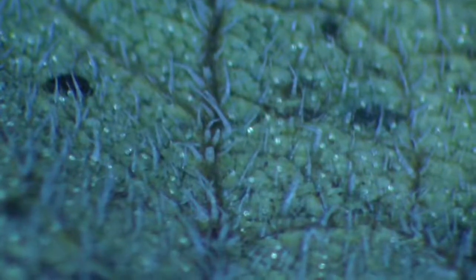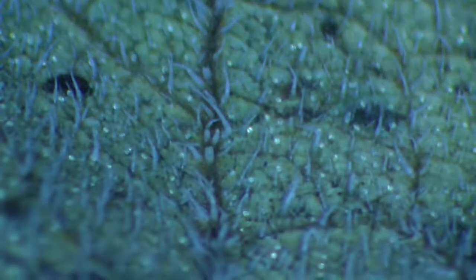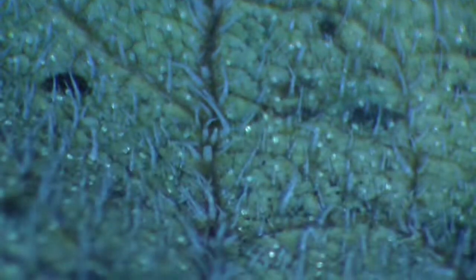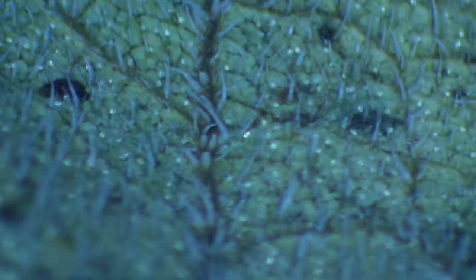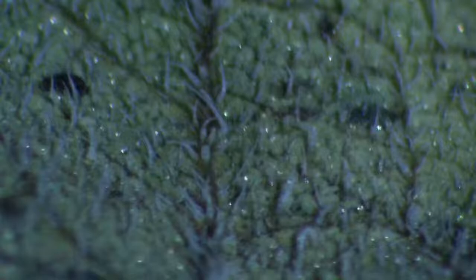That's a pretty damn hairy leaf. Look at that. Wow. And look at all those little crystalline bits on there. That's crazy. Let's try a different light angle, see if it's a bit different. Yeah, and you can really see the hairs. Little crystalline bits on there. Wonder what this looked like if it was fresh. Or if those crystalline bits are when it's dying. It's wild.